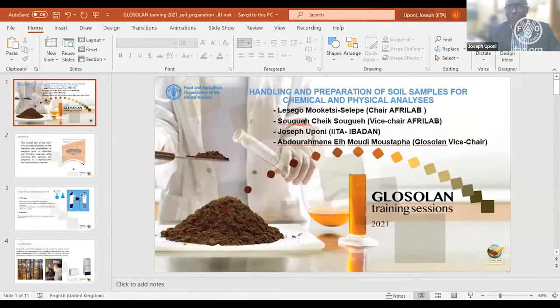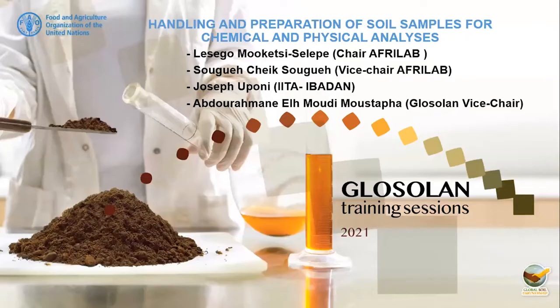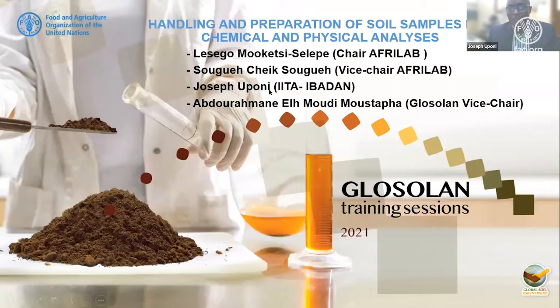This presentation is on handling and preparation of soil samples for chemical and physical analysis. Like I said, the presentation has been prepared by Sugeshik, but all of us have contributed, and some other people have contributed from other places also.